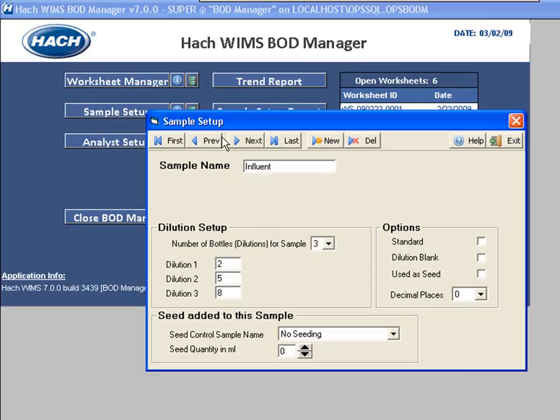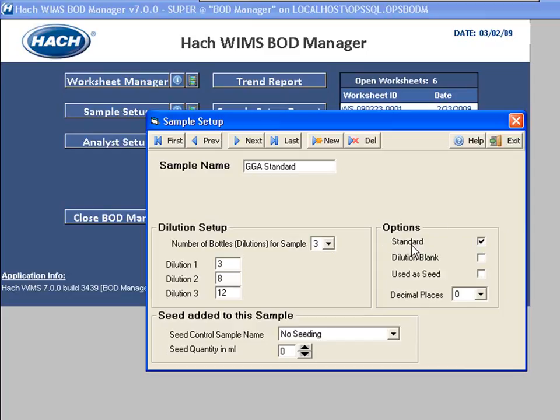This is where you're setting that default. Some of the more complicated parts of this is the GGA standard. This one has the option standard checked, which means when bottles are run, the BOD Manager worksheet looks at standard methods and is going to check these bottles against the standard — which I believe is 198 plus or minus 35. You set that in criteria setup, and the program knows to check these bottles against that criteria.